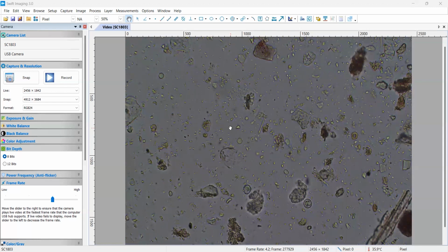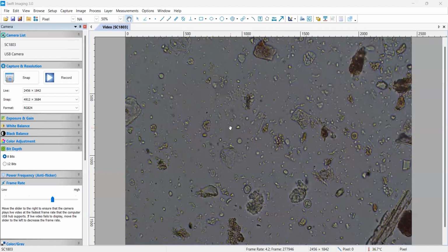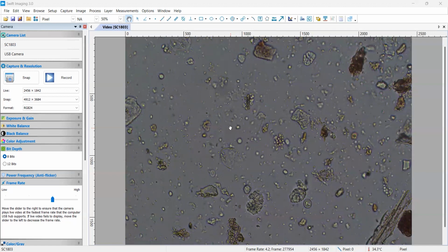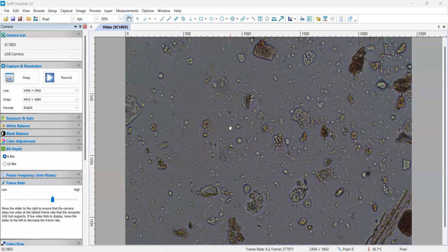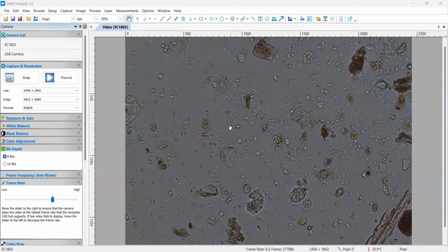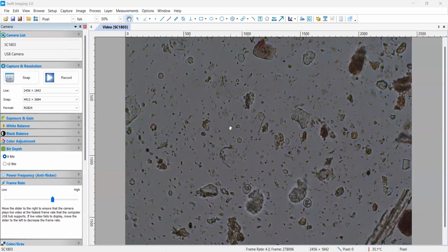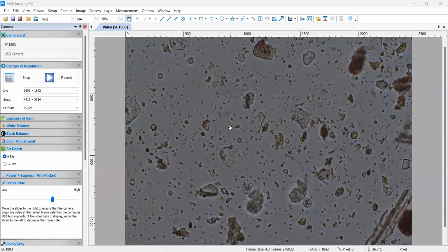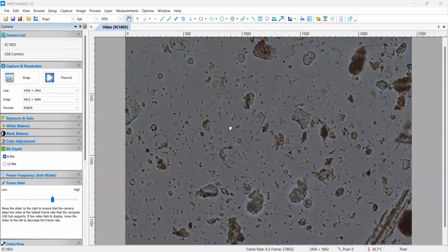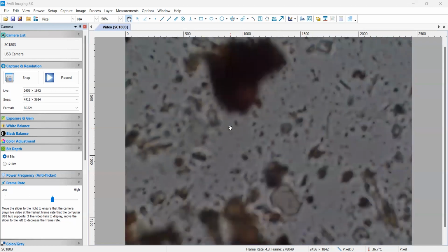See what we got in here. I'm looking for flagellates moving around, looking for ciliates zooming around. Both of those are in the protozoa group. We're looking for strands of something that may be like actinobacteria or fungus. Not seeing a lot in there. Mostly what we're seeing here is bacteria moving around, which is pretty fantastic. Go to another field of view.